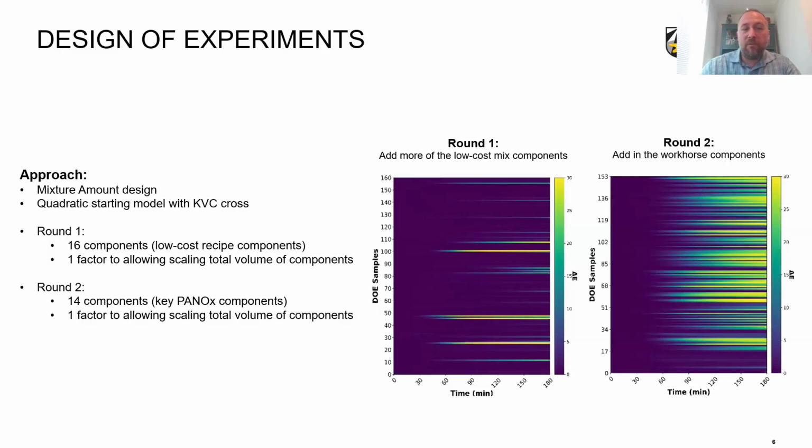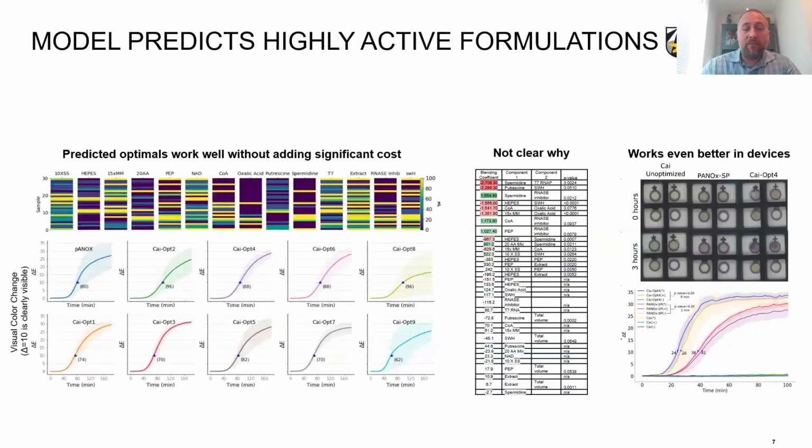And so we added some of those components on top of the low cost mix. And here we see much better response. And we're able to converge a model and predict some optimal formulations. So we tested some of these.